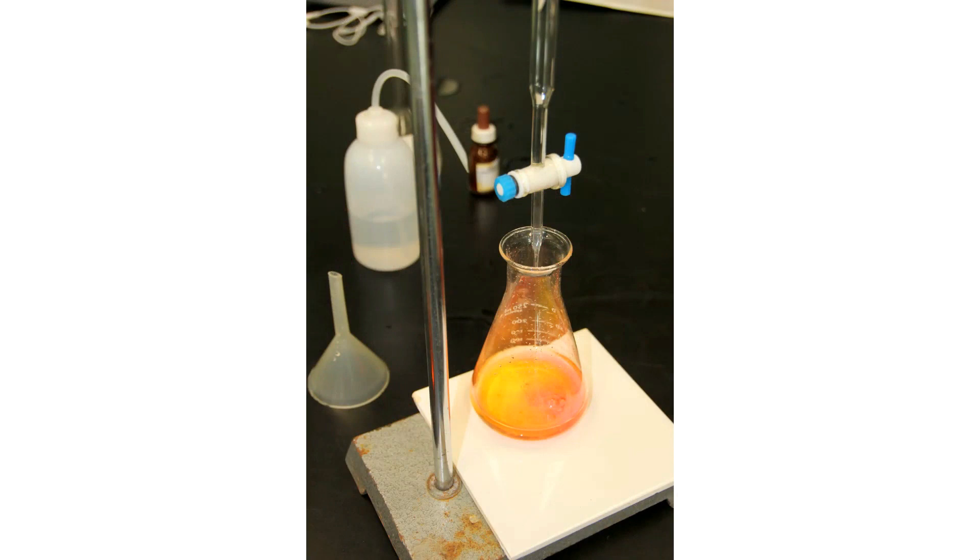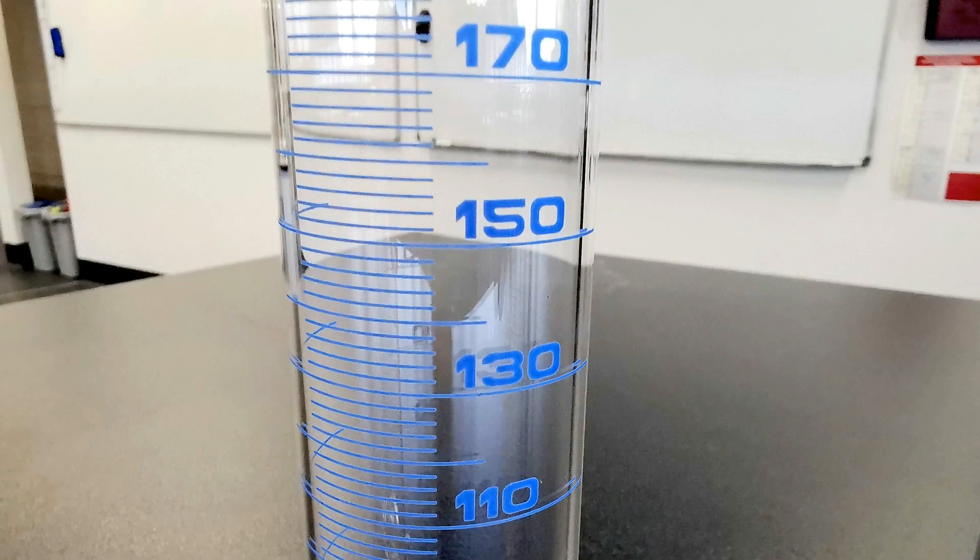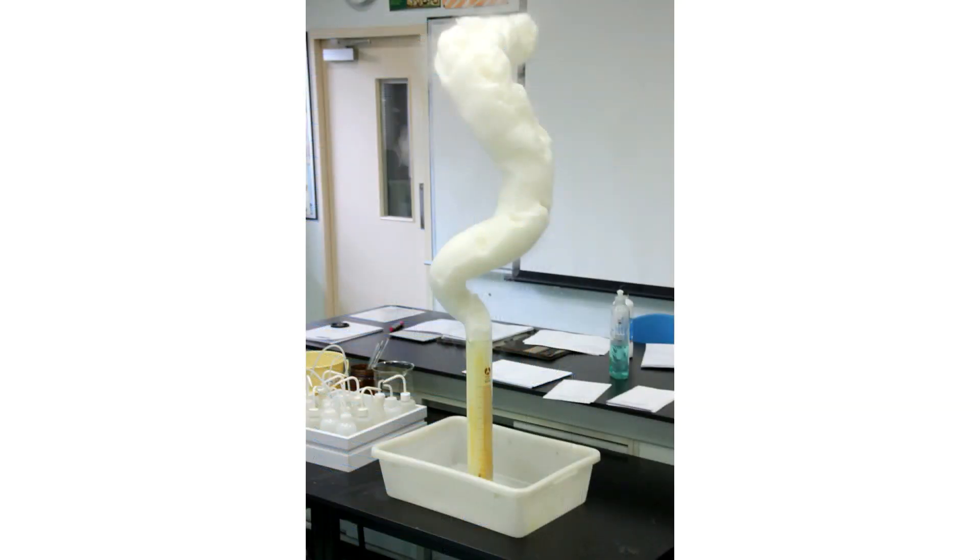In this case, doing a titration in a conical flask. Now these are what you would actually measure out with — their name is measuring cylinder, also called a graduated cylinder. We've got three different sizes here, the largest being a 250 ml measuring cylinder, also a 100 ml and a 25 ml. They have many more graduations, so these are what you'd use to measure an amount of solution much more accurately. You can also use a measuring cylinder to carry out an experiment — in this case the catalyzed decomposition of hydrogen peroxide, with a few drops of liquid detergent added to get foam.